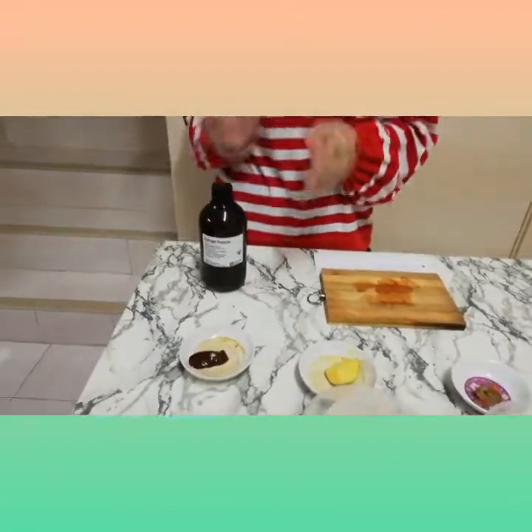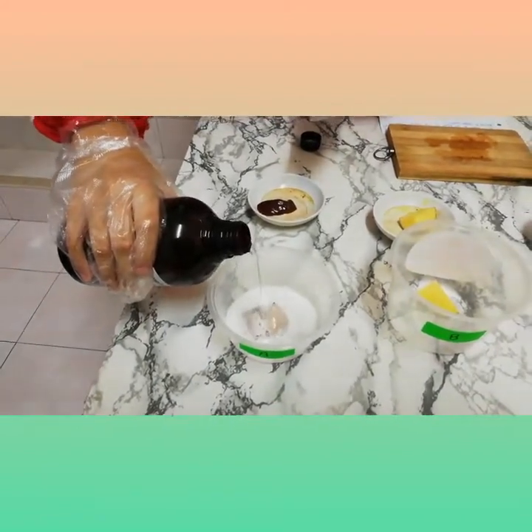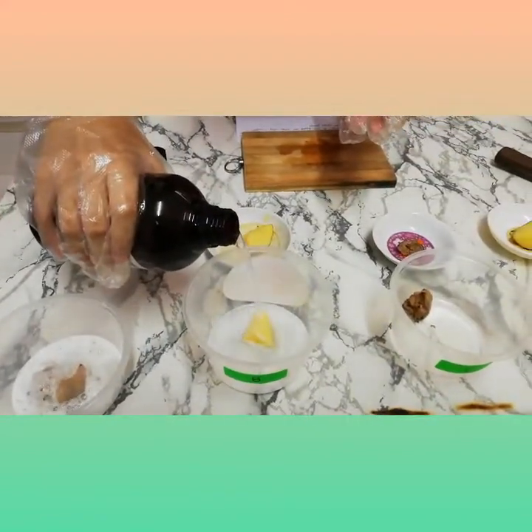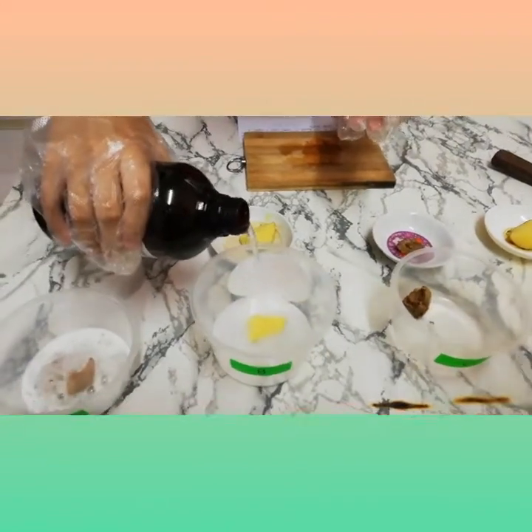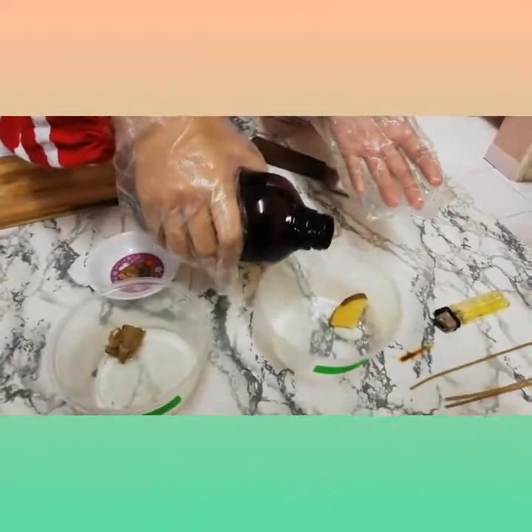Alright, fast forwarding from here. Some hydrogen peroxide into the containers. And remember, be very, very careful. Okay, there is no reaction happening here.